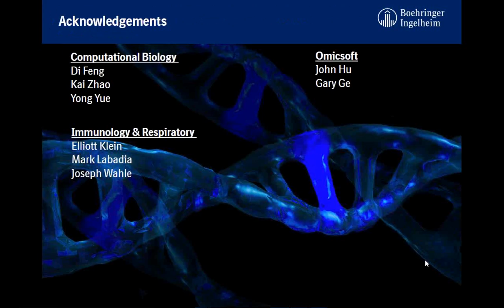Well, with 10x Genomics, the company showed a picture where they can deconvolve TH cells using a large sample size, right? So in some data, you still need to focus, depending on how deep you want to go. I showed the example of TH17. Of course, if you're doing PBMC, it's very, very difficult to deconvolute and see all the information about a small fraction of cells. So you need to really estimate; it doesn't mean you do all PBMC and solve the other questions.